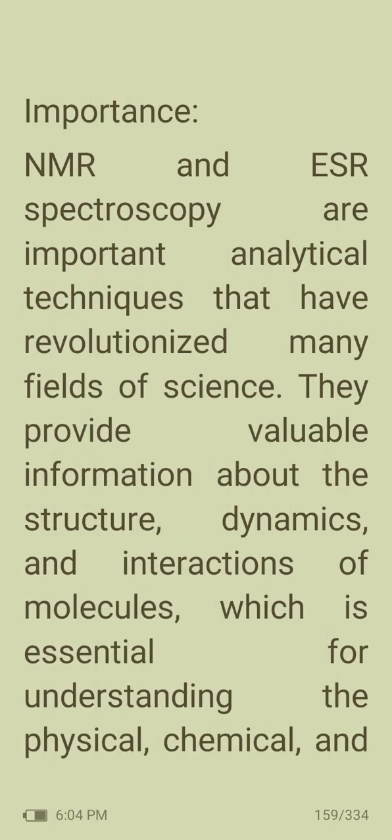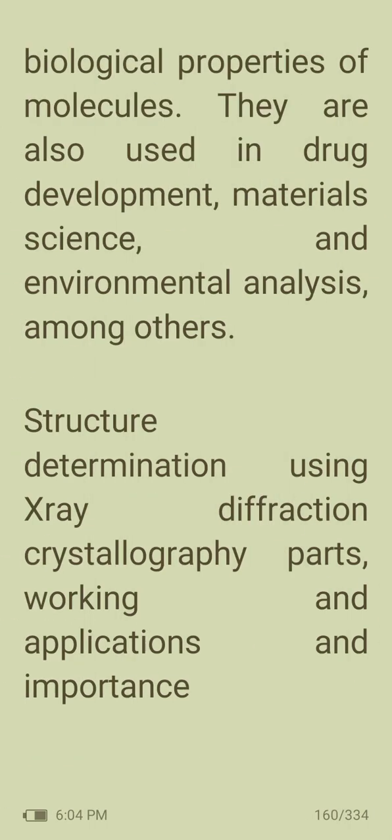What is the importance of NMR and ESR spectroscopy? These are important analytical techniques that have revolutionized many fields of science. They provide valuable information about the structure, dynamics, and interactions of molecules, which is essential for understanding the physical, chemical, and biological properties of molecules. They are also used in drug development, material science, and environmental analysis, along with other fields.